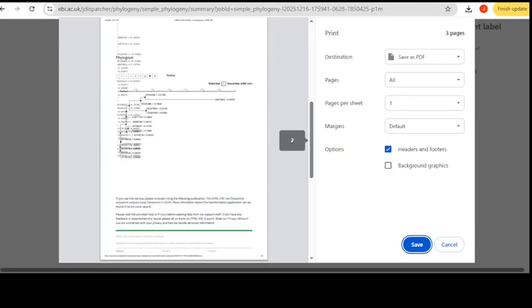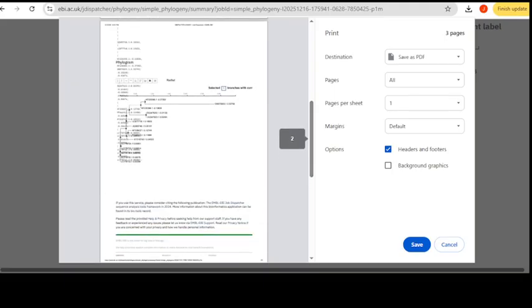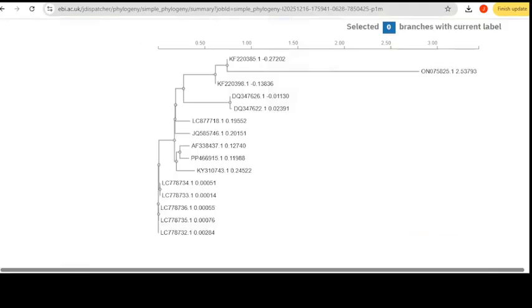After that, you can save it as a PDF. Once you have it nicely done and separated, then you can open it. But I think a snapshot will be really good. Snapshot with a snippet gives you a wonderful outcome.